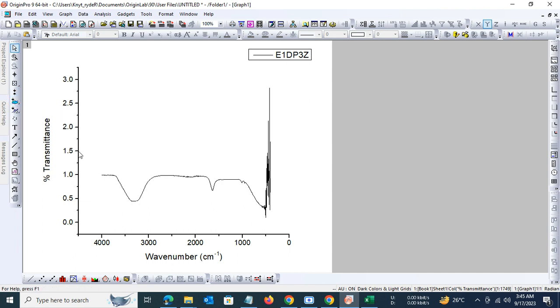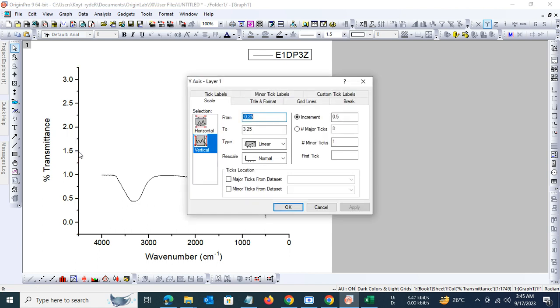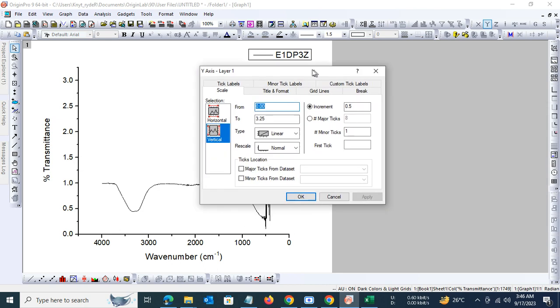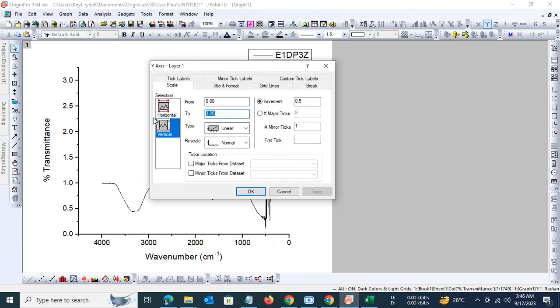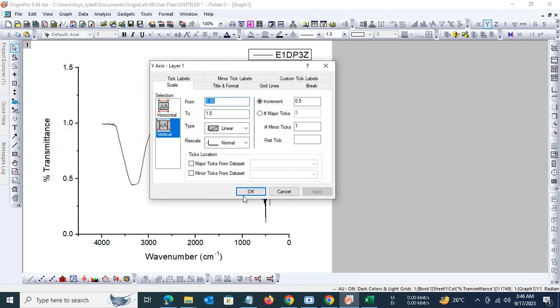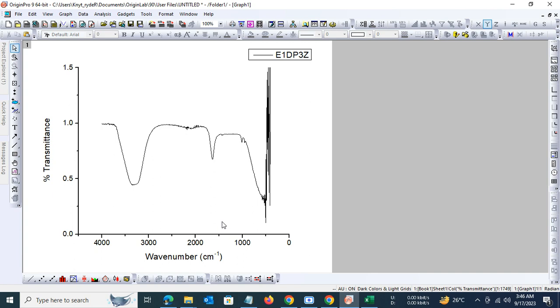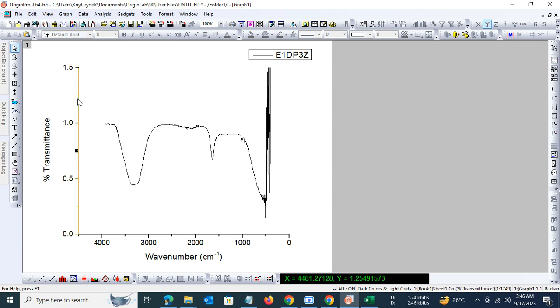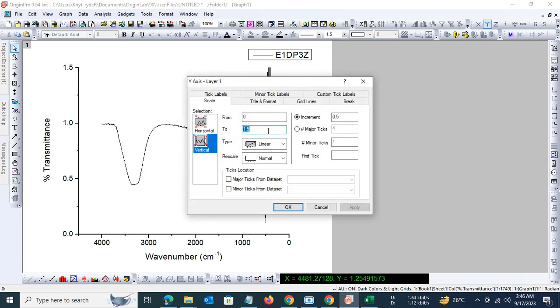Let us set the y-axis between zero and approximately 1.5 for a better representation. Actually, we can go lower than 1.5. Let's see what the data point here is. 1.25, that's okay. So let us set the y-axis as 1.25.